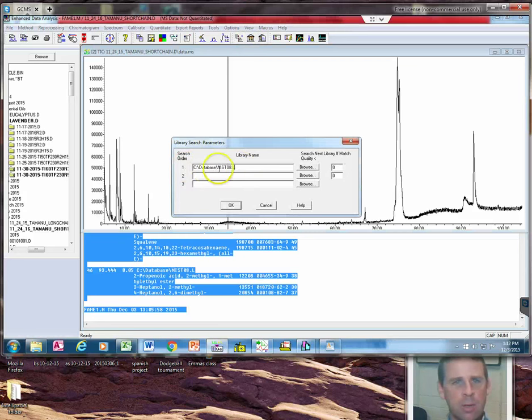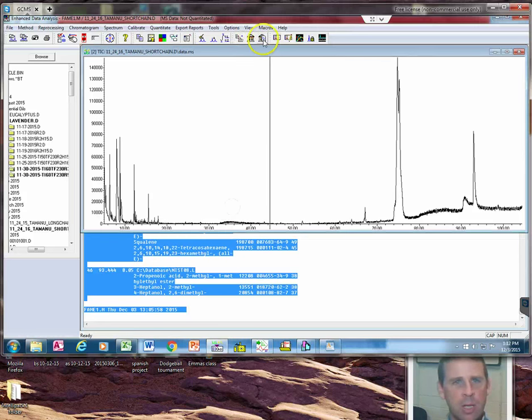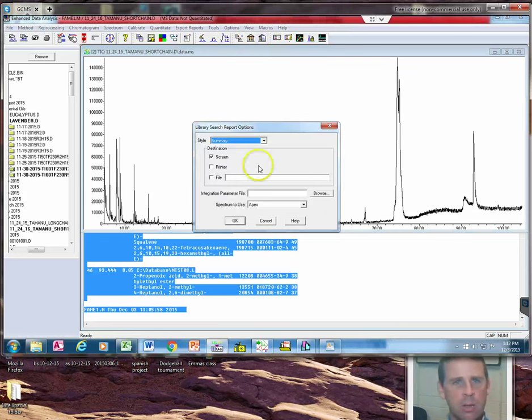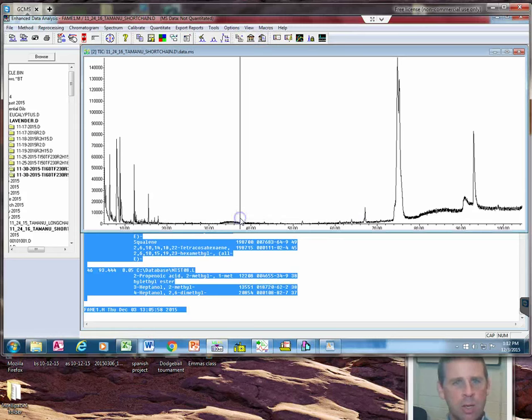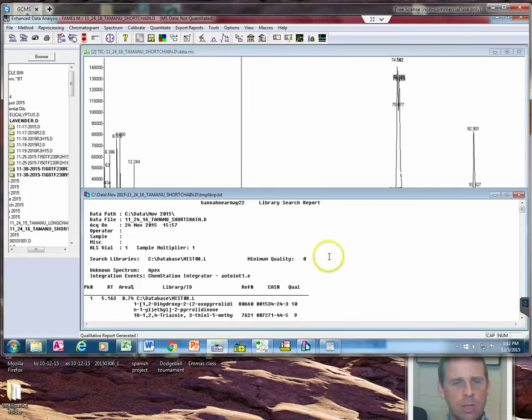Then I click right here and make sure that this says NIST 08 to this path, and we say OK. Then I click right here and say OK, and then it's going to generate a report. Here's the report that it generated.